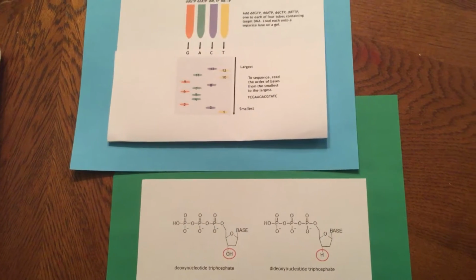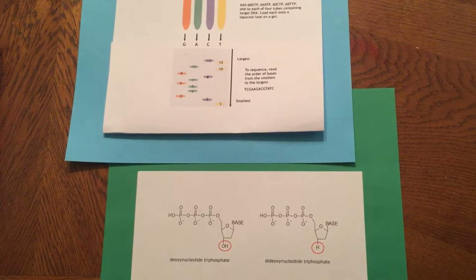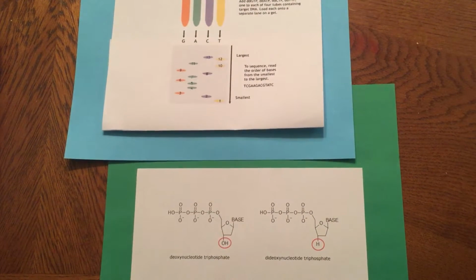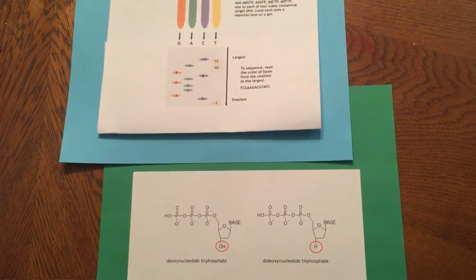So you heat the strands, separate them, and there it changes. Then you only use one primer in cycle sequencing, and you only end up with one strand instead of the two. Another difference is that along with the nucleotides, you're also adding dideoxynucleotides.